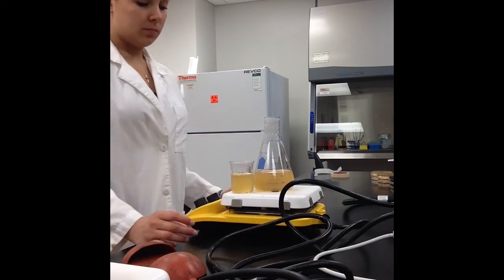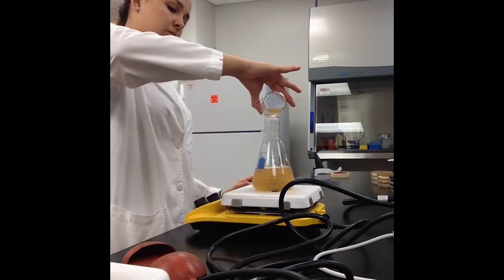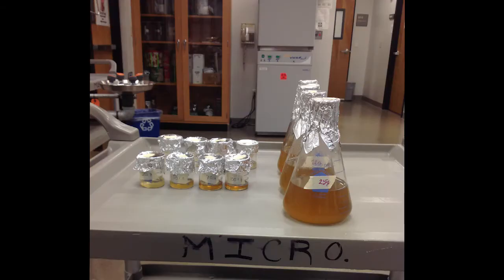After letting the solutions stir enough before they boiled, but enough so that they were completely soluble in the water, we went ahead and placed our Erlenmeyer flasks into the autoclave. The autoclave is a machine that completely sterilizes anything you put into it at a very high heat and pressure. This sterilized all of our materials before we poured them into our Petri dishes.